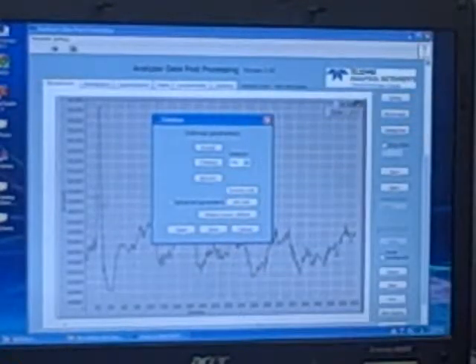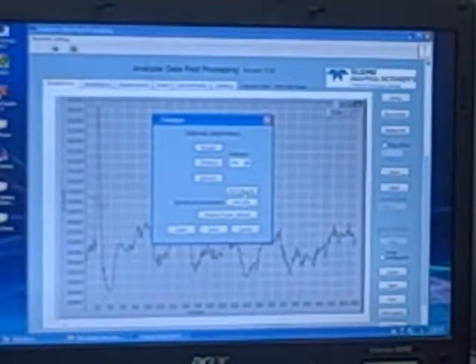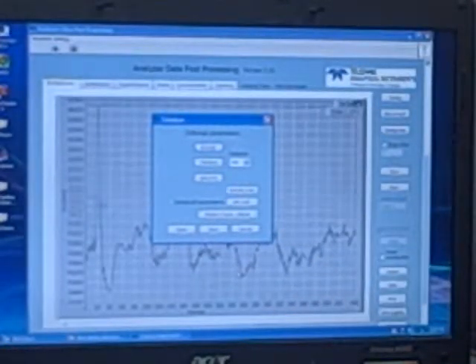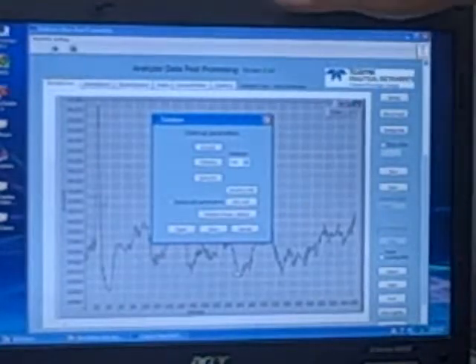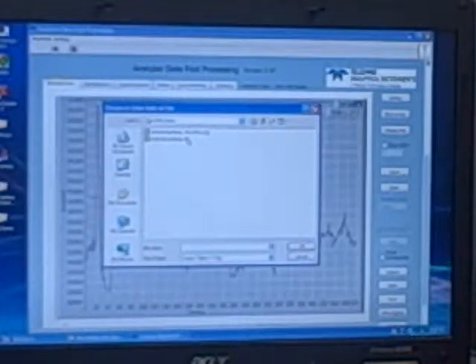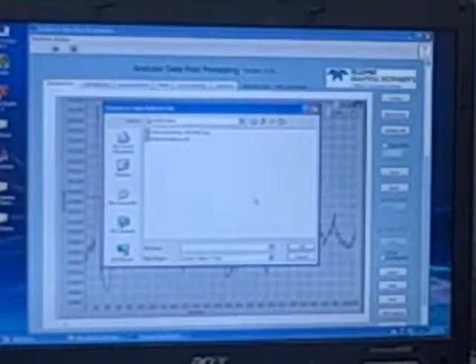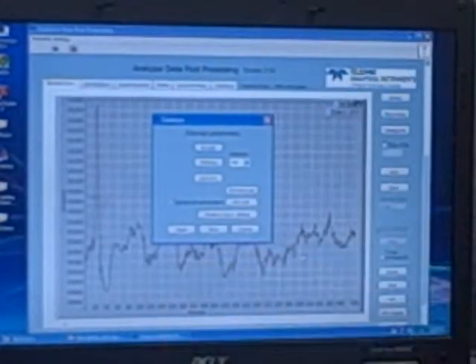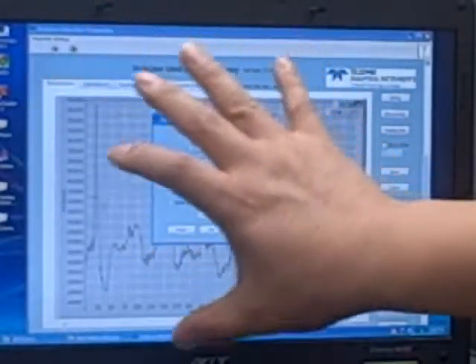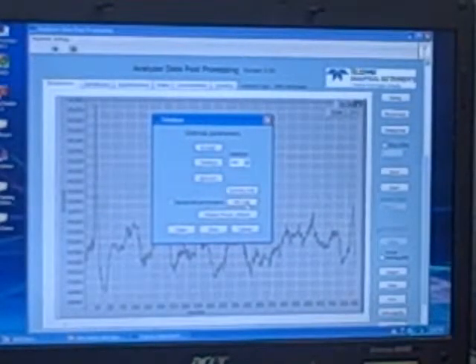Among here, you have other functions. For example, this detector you don't have to worry. You can put always FID, RTC, doesn't matter. Download, if you click it, it is download all internal settings of the timing, range, group setup into the computer. Okay? If you click open, it will open previously saved setting files into the current page. Okay? And then you also have a function of upload. That means you copy these digital settings into the analyzer. So you do not have to manually make all the changes.